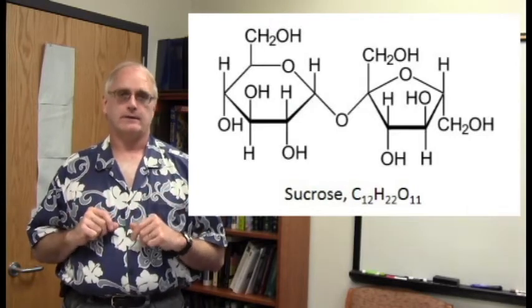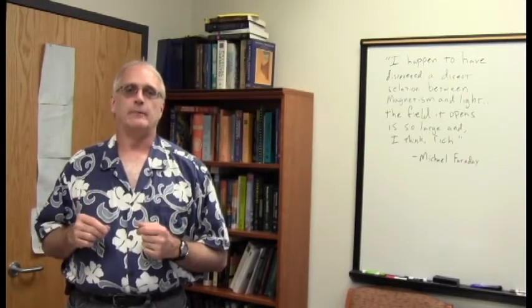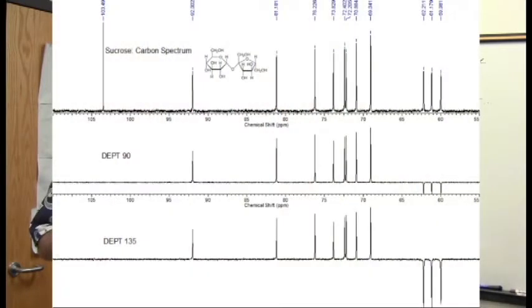Here are the carbon DEPT-90 and DEPT-135 spectra of sucrose. Usually I like to present them in this stacked format where the three spectra are vertically aligned so that the peaks are right over the top of each other. And if you look at from the carbon-13 to the DEPT-90, you will notice there are eight large peaks all standing straight up here. The peak at 103 ppm is gone. The other three clustered around 60 ppm, while there are slightly inverted and much, much smaller, much, much truncated compared to the regular carbon. I take this as pretty strong evidence. We do have eight CHs in there.